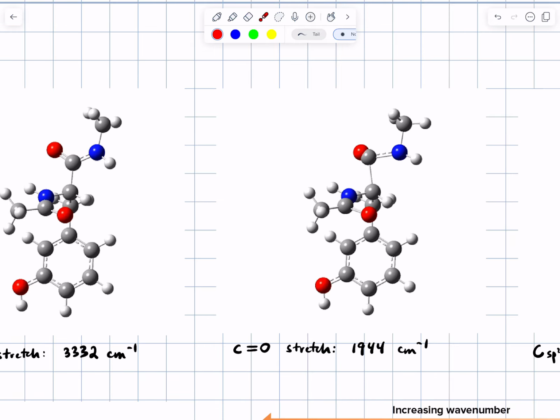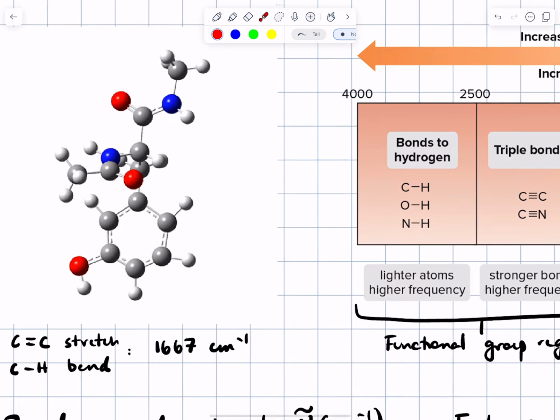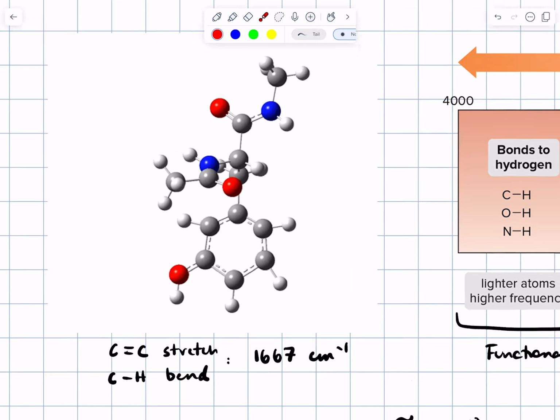And in large molecules, some of these vibrations are coupled. For example, you see this carbonyl vibrating, and this one nearby is sort of getting its groove on a little bit too. The groove is a little bit contagious. Let's see, some more CH stretches. Here is stretching of a CC bond in a benzene ring at the same time as you're getting some CH bond bending, and that frequency is around 1,600.